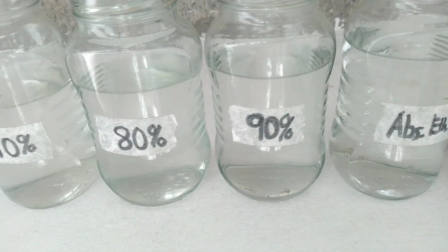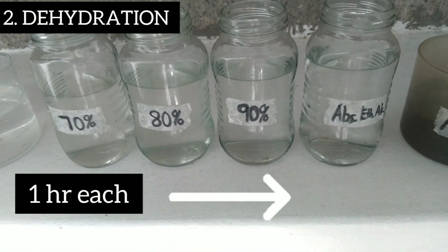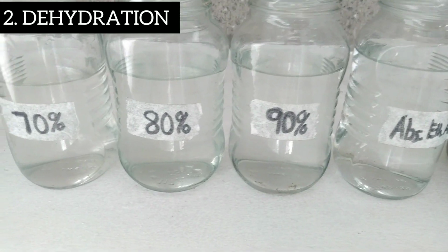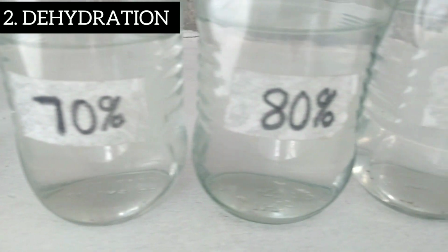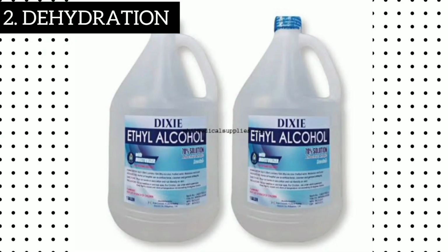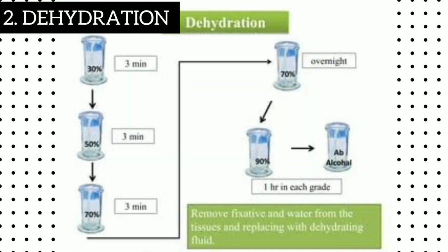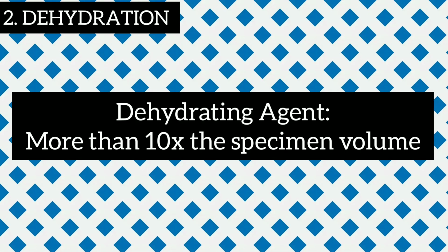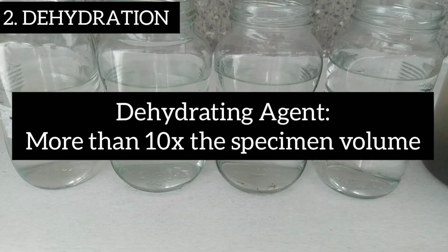The next step is dehydration. Dehydration is the process of removing extracellular and intracellular water from the tissue using increasing concentrations of dehydrating agent, such as alcohol. Water is immiscible with paraffin wax, thus it needs to be completely removed. A general rule in dehydrating specimens is that the amount of dehydrating agent should always be more than 10 times the volume of the specimen.